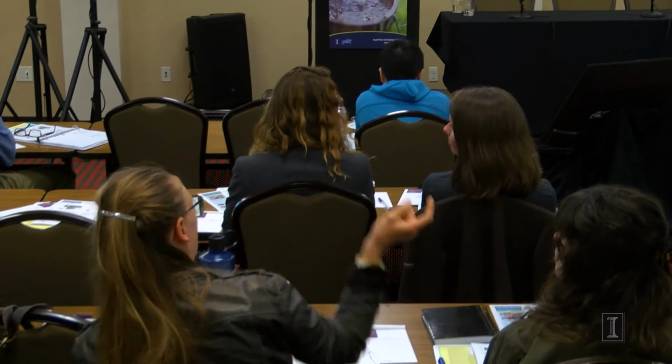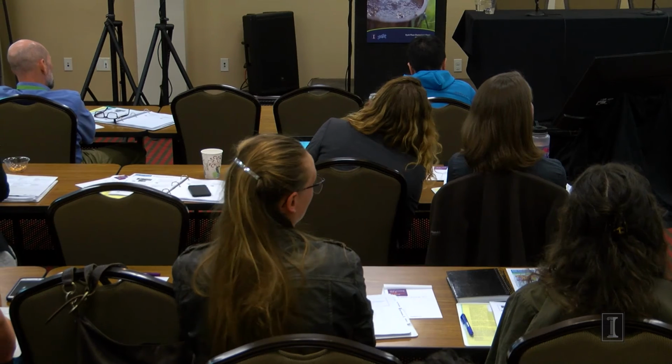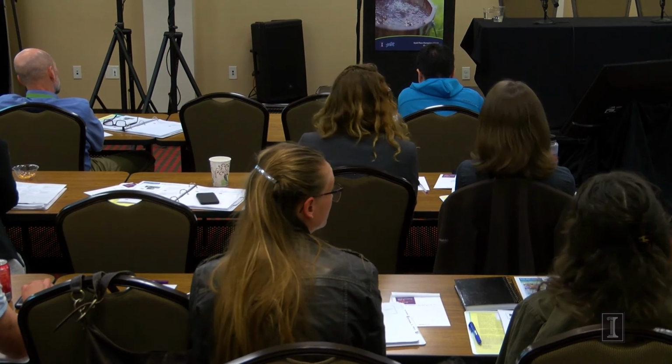I was wondering if you had any anecdotes about private labs that had given data over to public health labs to help bridge gaps in data coverage, where the public health lab may not have the reach. That's a good question. I can't think of anything off the top of my head where I've heard from our members about that, but I can ask some people and get back to you. In Vermont, private labs have to report all their results to the public health laboratory, and then the public health department gets the data into a database and stores all that data together. Thank you.